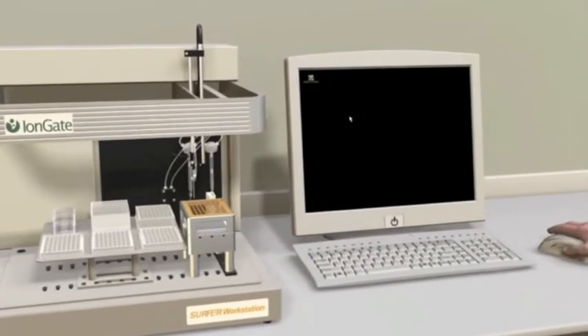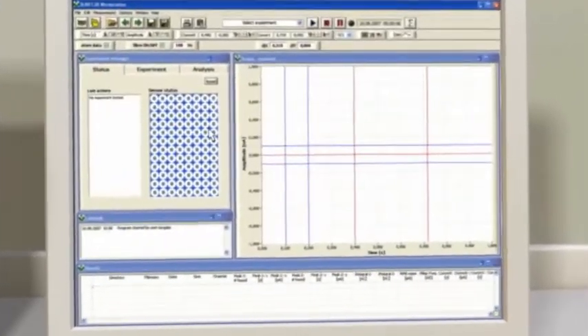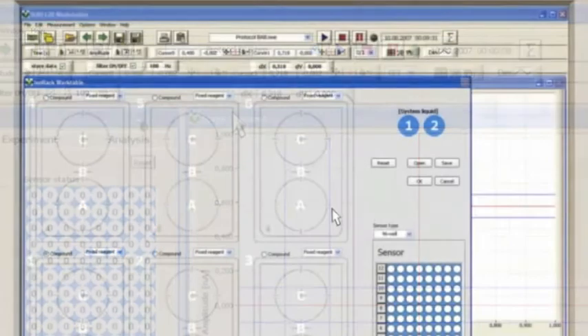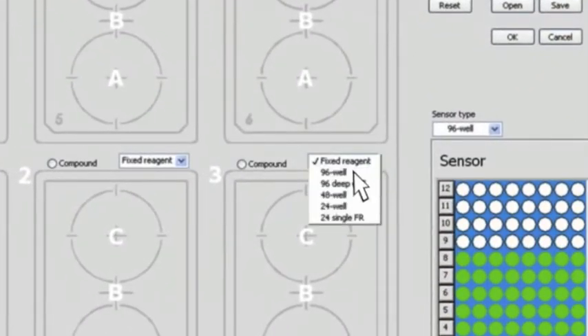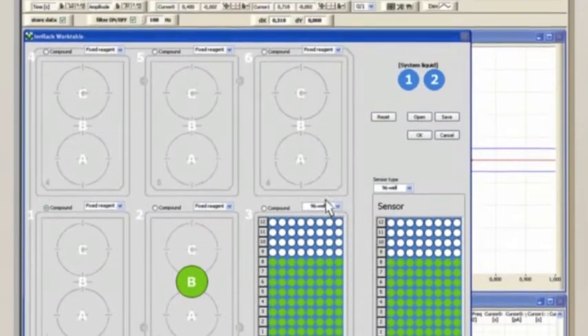It is controlled by user-friendly software running on a standard Windows XP computer. To easily set up the experiment, predefined measurement protocols are available. Afterwards, the configuration of buffer containers and sensor positions are defined in the work table. Then, templates for activation solutions and assay reagents are selected.